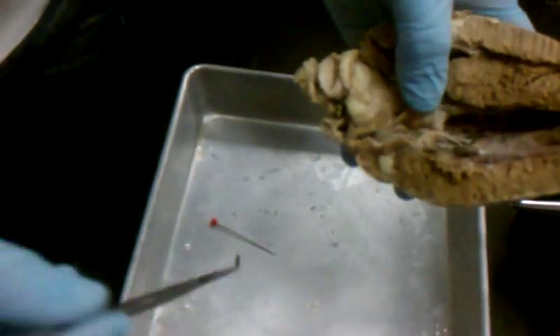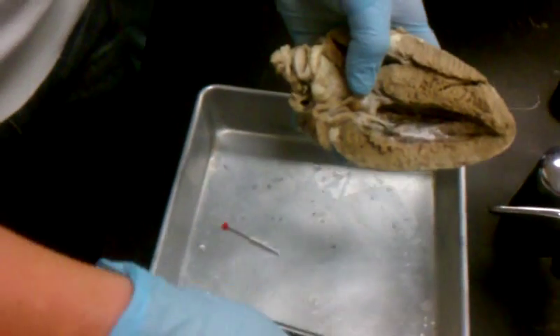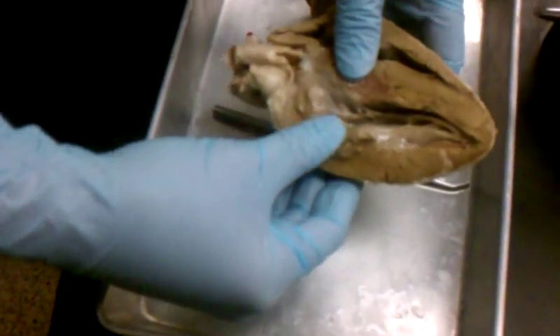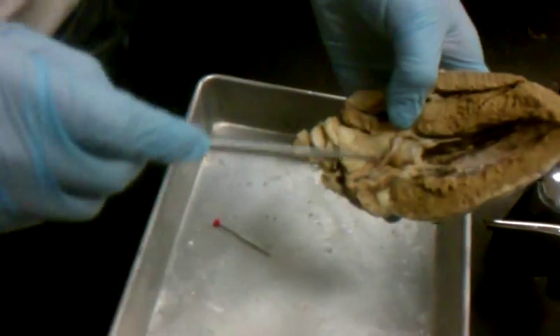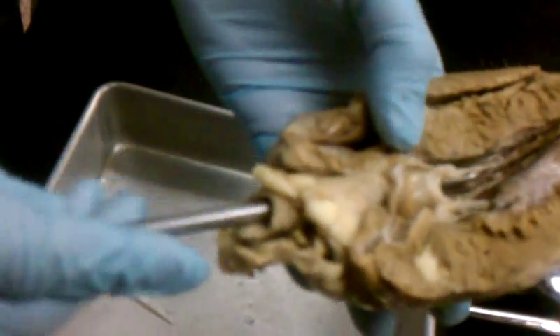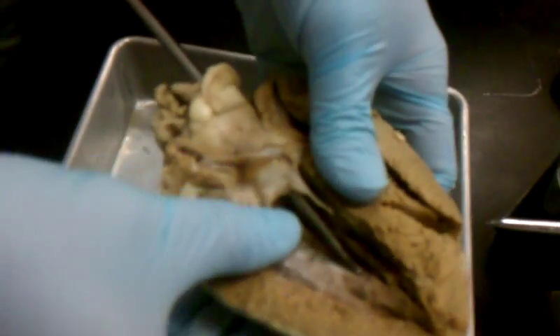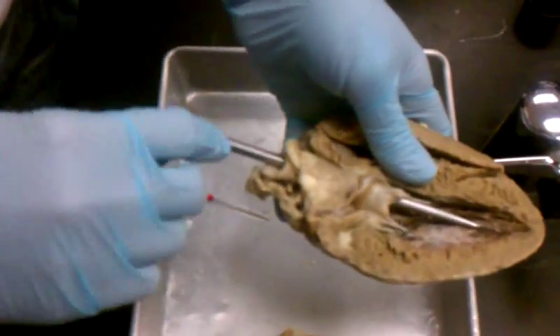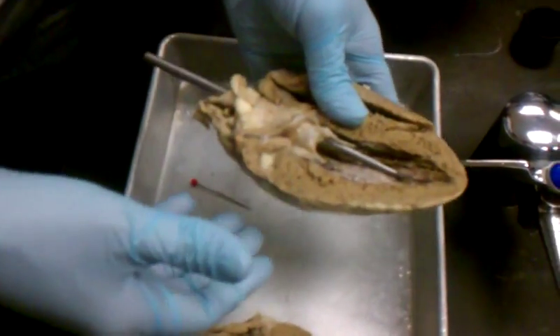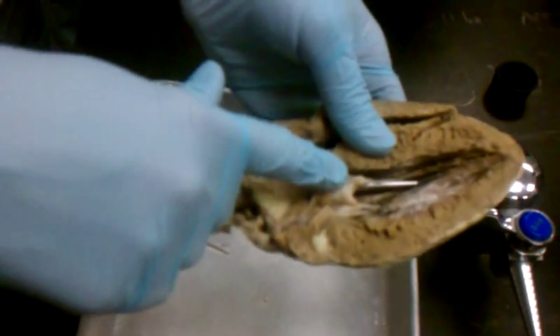Actually, don't pay attention to what I just did, because this is, like I said, cut weird. So what I do is I'd be like, okay, here's my atrium, here's my ventricle, what connects it? It would be this. Let's see if this one has a better one. So, not really. So it's actually this right here. Because if I stuck a probe through that, this is the aorta. It's the left ventricle. So what valve would that be? Aortic valve. A lot of the TAs will do this. They'll stick a probe through it and say, what valve is this? I think this is a lot easier to tell than putting a pin in here.